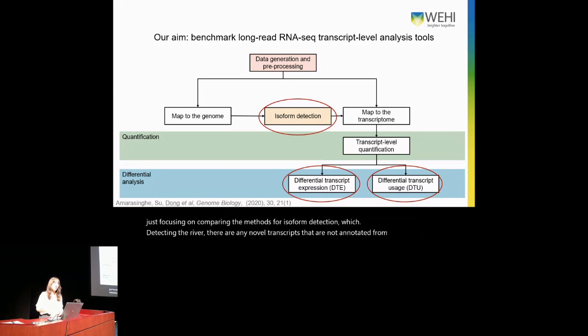We also compare methods for downstream analysis, like differential expression and differential transcript usage analysis for the transcripts, which focuses more on alternative splicing.